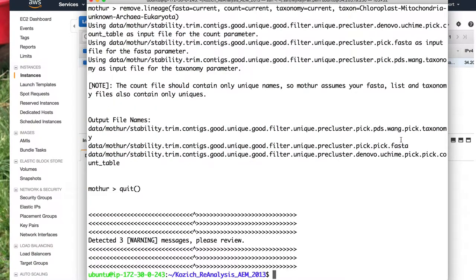The analysis finally finished. One thing you might notice is that I lived on the edge and did not use tmux to run the analysis. Running tmux probably would have been a bit safer because if my internet had gone down, the analysis would have kept running even though I would have been logged out of EC2. The next thing we'd like to do is run the next batch in our analysis workflow.